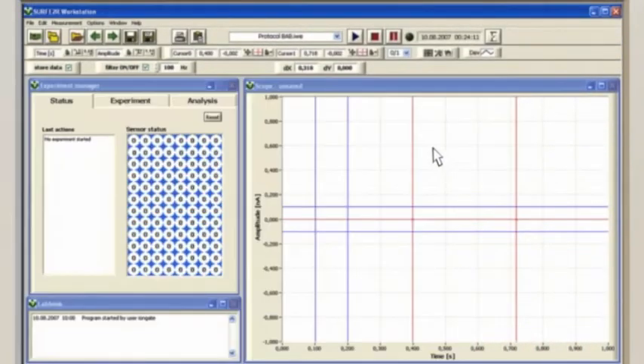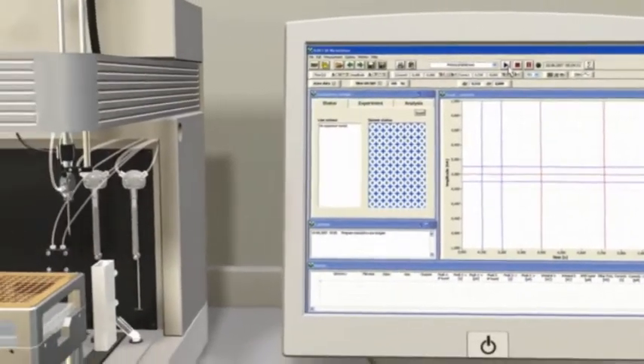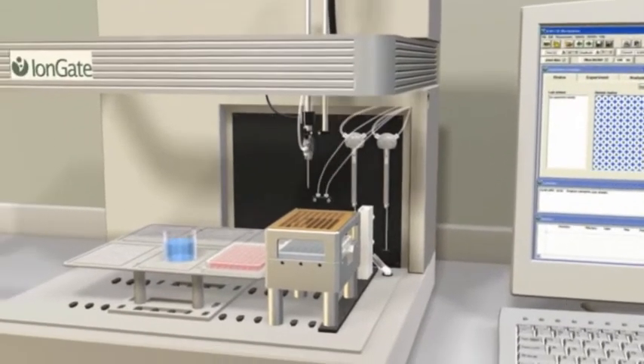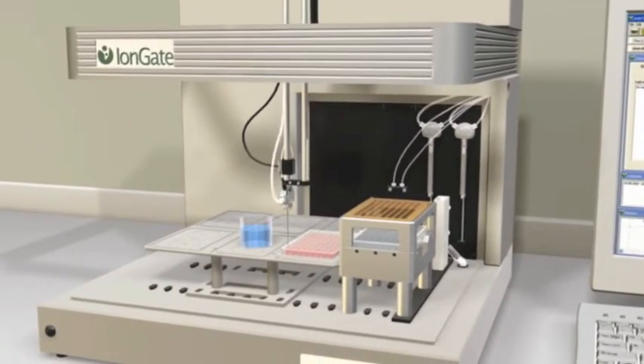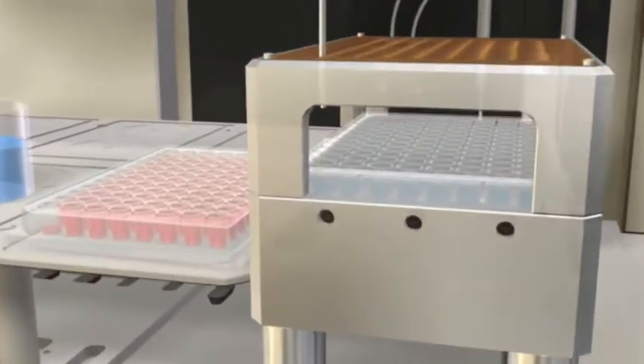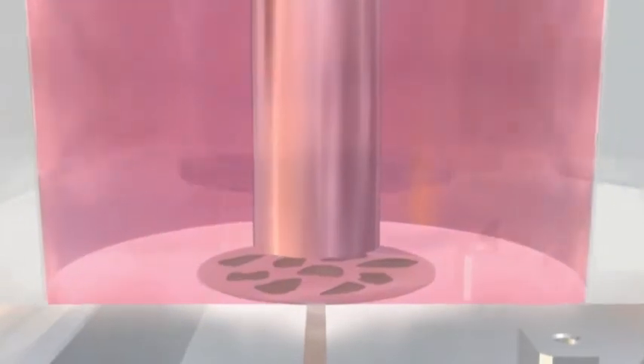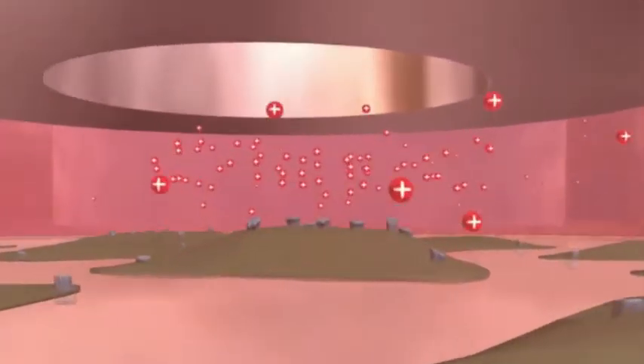A simple click on the main window starts the experiment. The XYZ drive, equipped with a specially designed liquid handling module called the IonJet, picks up activation as well as non-activation solutions. Then the IonJet moves to the sensor plate and the activation solution is dispensed into the sensor well in order to rapidly replace the preloaded non-activation solution.